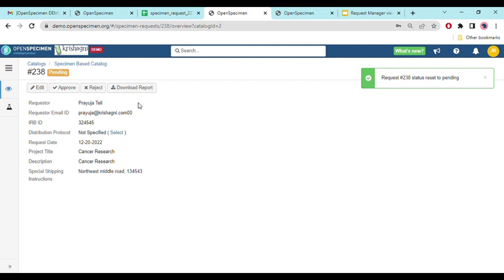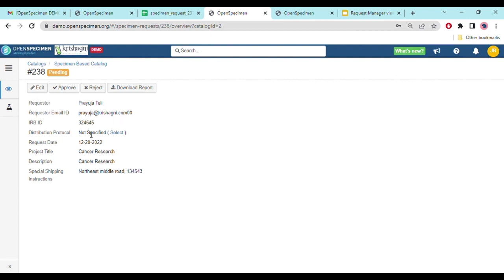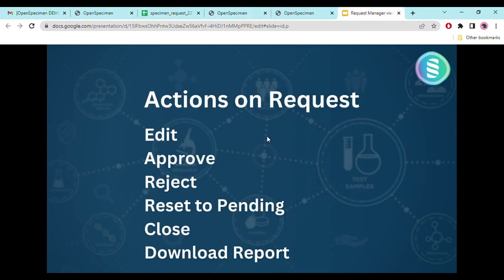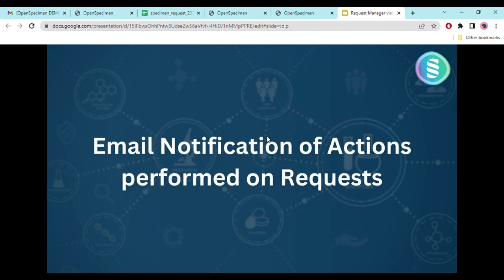You can download reports, which I'll cover further in another video. This covers the approval, rejection, and reset to pending workflow. You can also edit the details of the request form — if any details are missing, you can use the edit option and update the information.